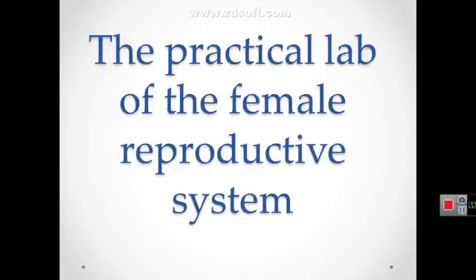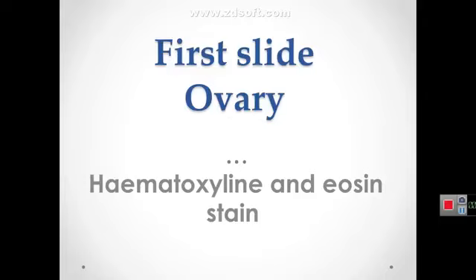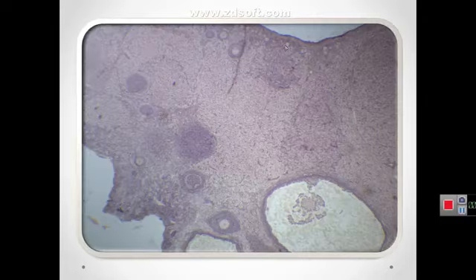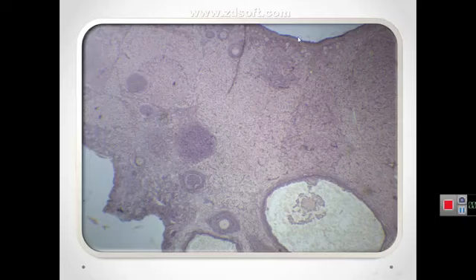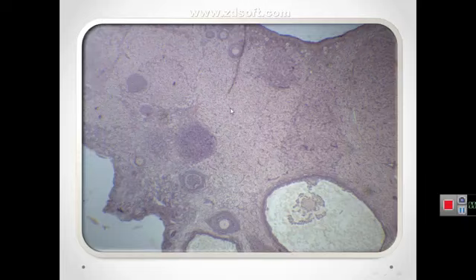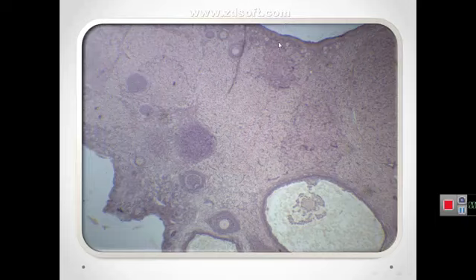Our topic today is about the female reproductive system. The first slide is a section in the ovary. Each ovary consists of the cortex and the medulla. The cortex is a region with a stroma of highly cellular connective tissue and many ovarian follicles.